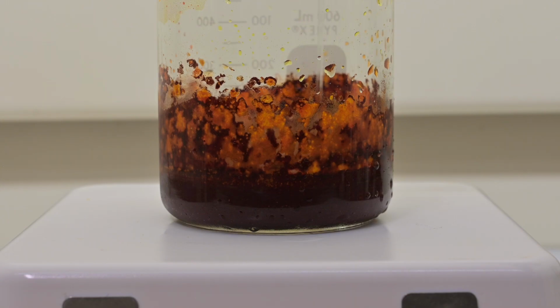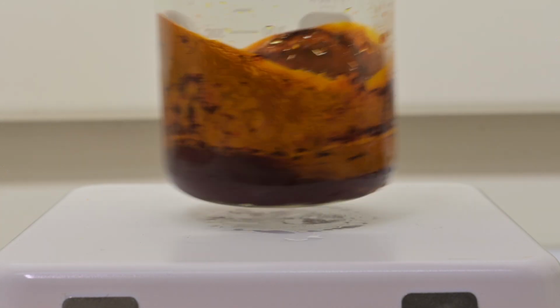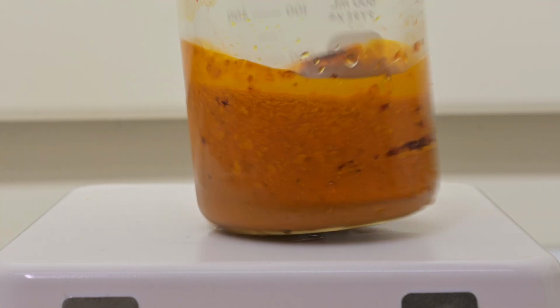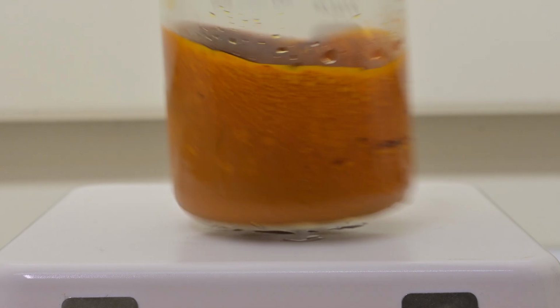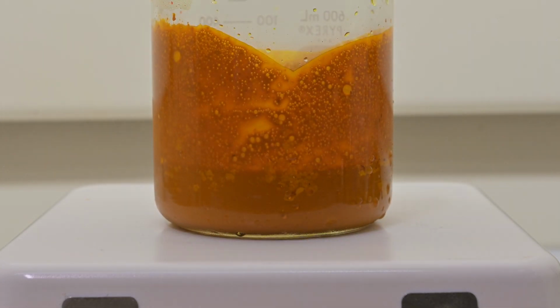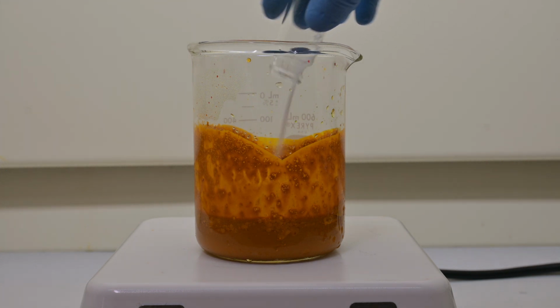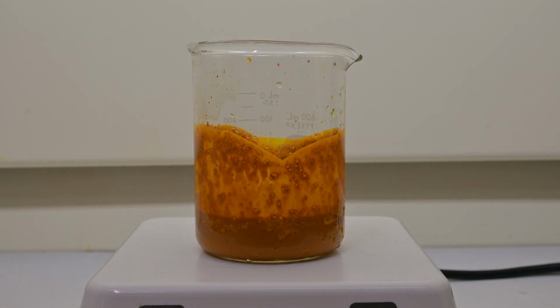Finally, we make the solution strongly alkaline by adding a solution of 3.5 grams of solid sodium hydroxide in 10 milliliters of water. This addition causes the deep red color to change to a yellowish orange. The methyl orange precipitates as well. We can make it precipitate more completely by adding 10 grams of clean salt.